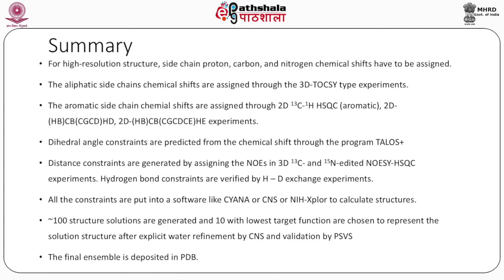Distance constraints are generated by assigning the NOEs in 3D C13 or N15 edited NOESY HSQC experiments. Hydrogen bond constraints are verified by HD exchange experiments. All the constraints are put into a software like Cyana or CNS or NIH Explor to calculate structures.